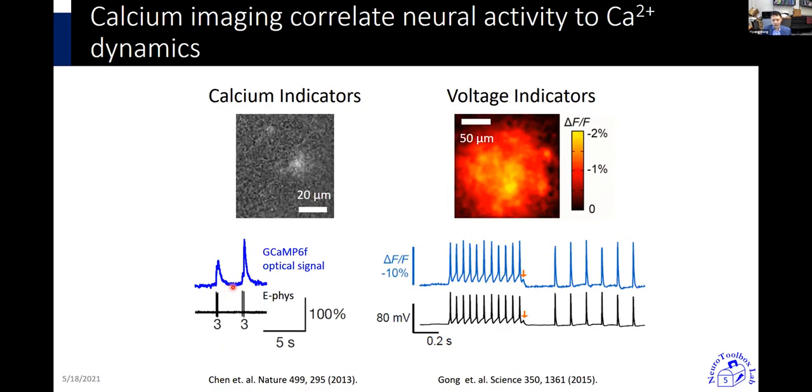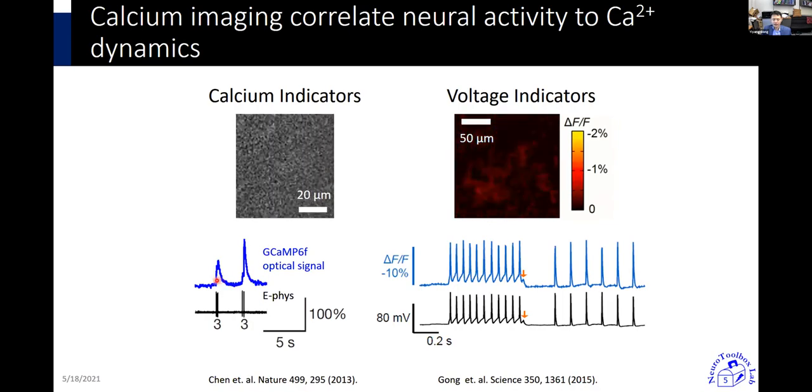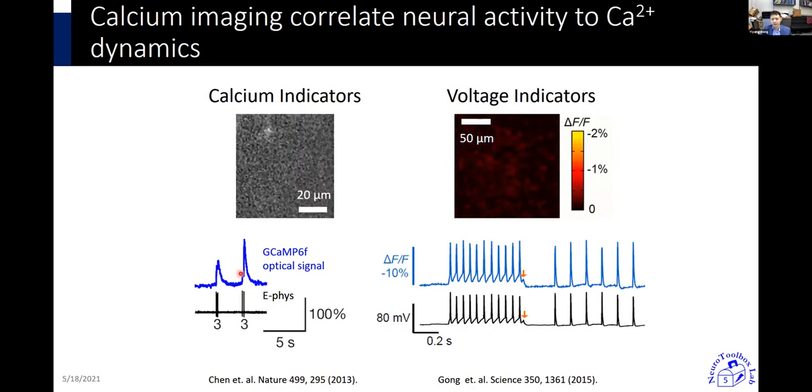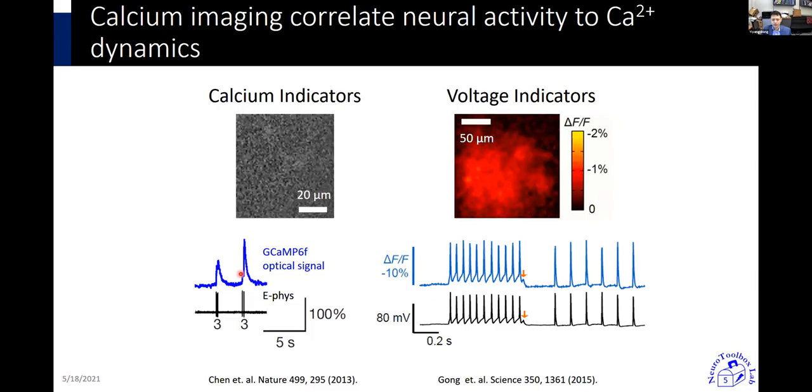If there were other waveforms, perhaps they wouldn't get picked up as well by the sensor. But for the most part, especially excitatory neurons in the brain will have this temporal pattern, and it's very effective in enhancing the signal to noise of those types of features.